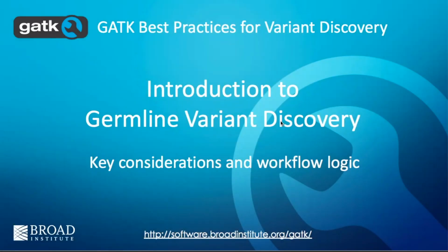So in this talk, I'm going to walk you through, in fact, give you an overview of what's involved in germline variant discovery. How these talks are organized is day one, we're just doing introductions to all of these pipelines. Don't worry if this is too much information. We're going to go over each tool and each pipeline again each day. So day two is going to be all germline focused, and we'll talk more in detail about each tool and go over this set of slides again tomorrow.